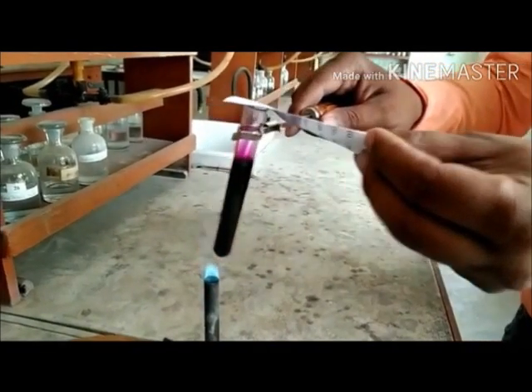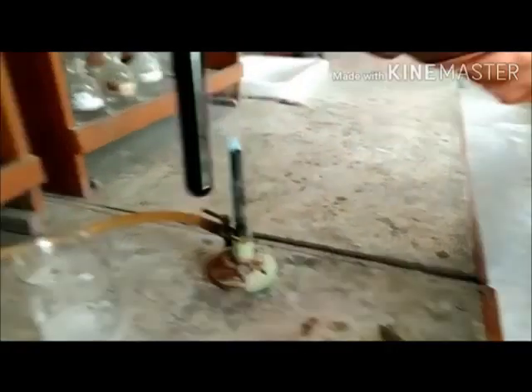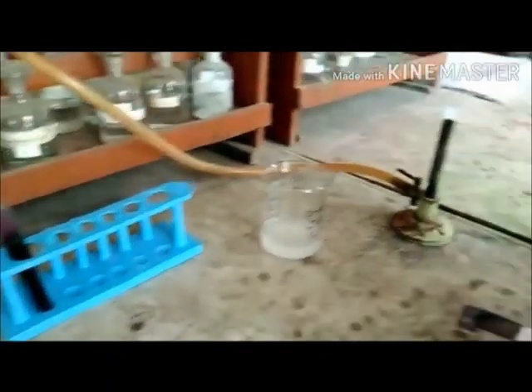If we have a look into the test tube, no crystals are left at the bottom, and the iodine particles which sublimated have condensed on the walls of the test tube. You can see that the paper that was dipped in starch solution has turned blue.